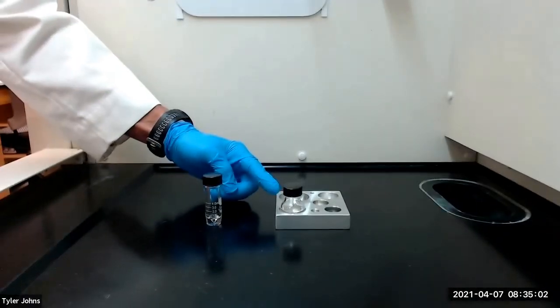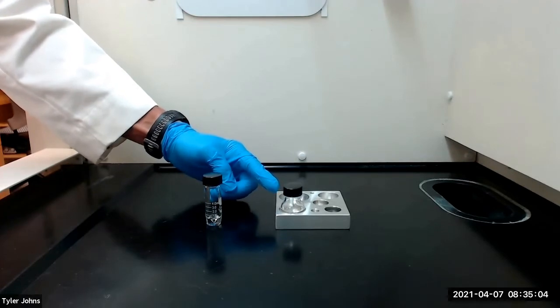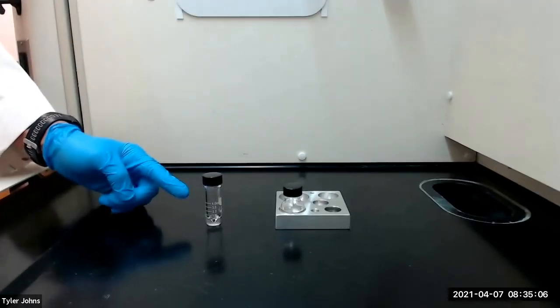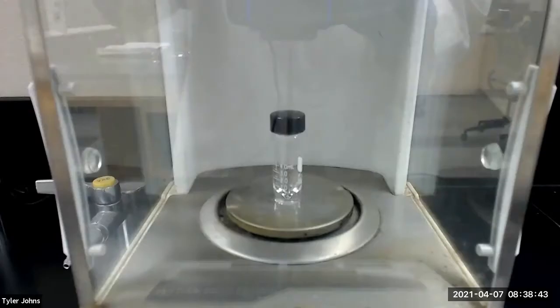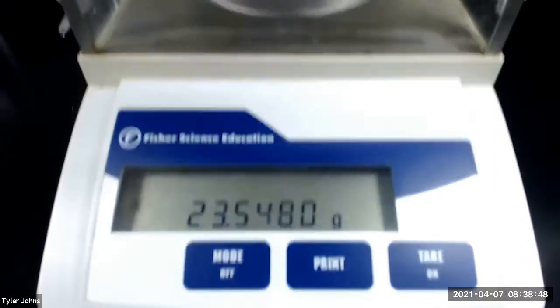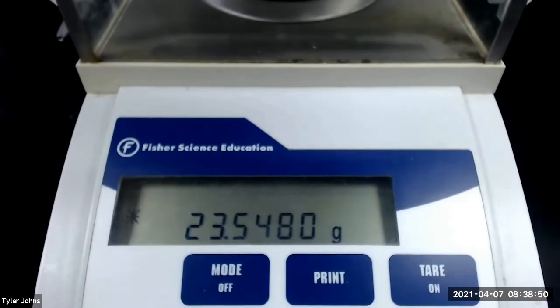After transferring the crude ester to the 10 milliliter round bottom flask, we next need to pre-weigh a 5 milliliter conical vial, which we will be using to collect the final product. The mass of the pre-weighed 5 milliliter conical vial is 23.5480 grams.